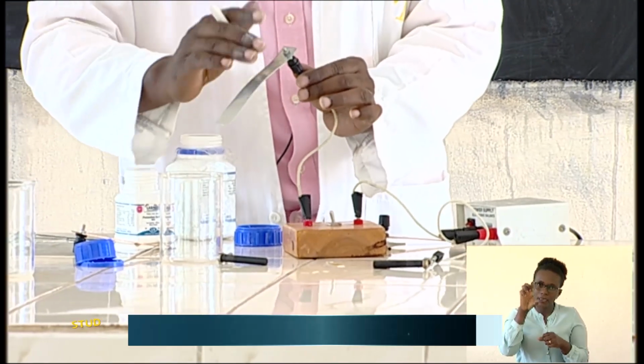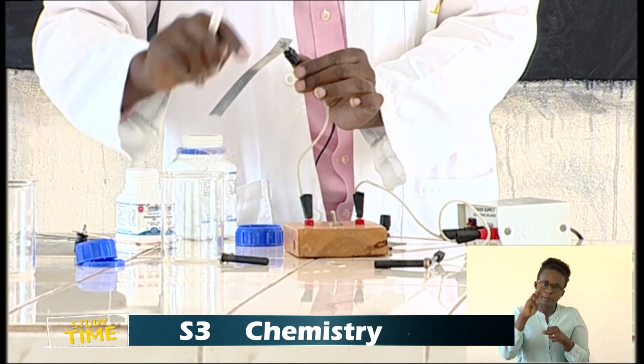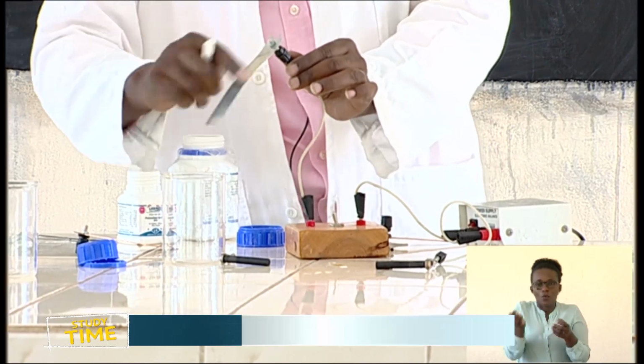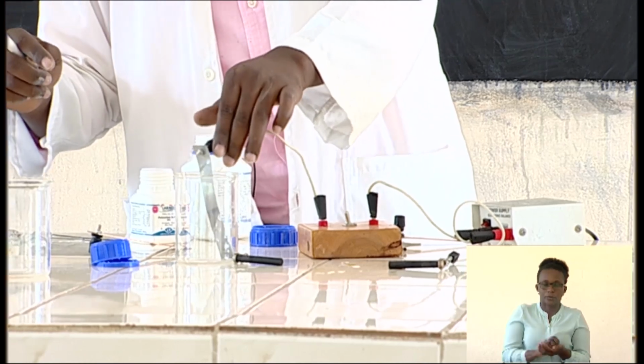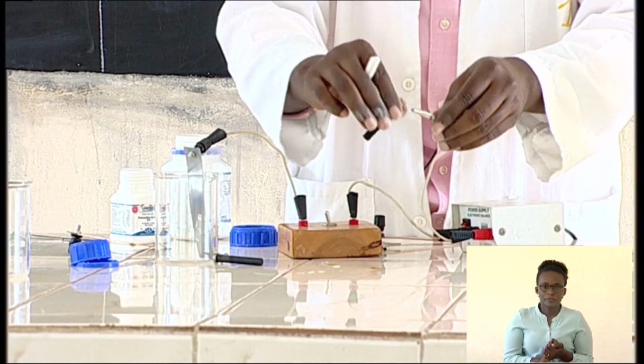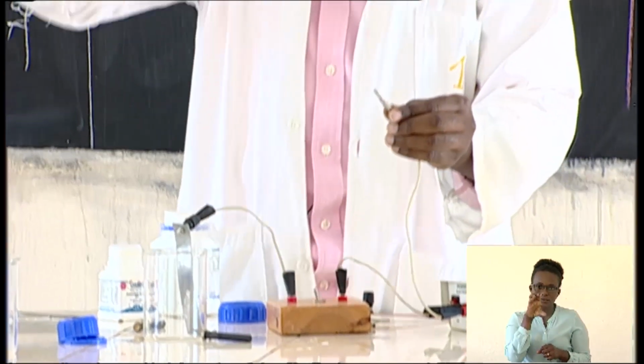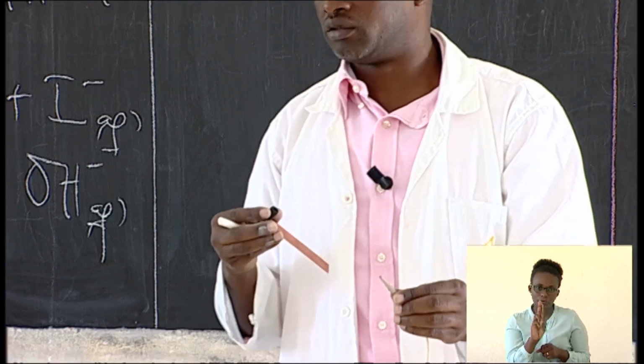A thin layer, we expect to see a thin layer of copper to cover this one, so we will not have this white or shiny white substance. And this is the metal that will be used for coating.